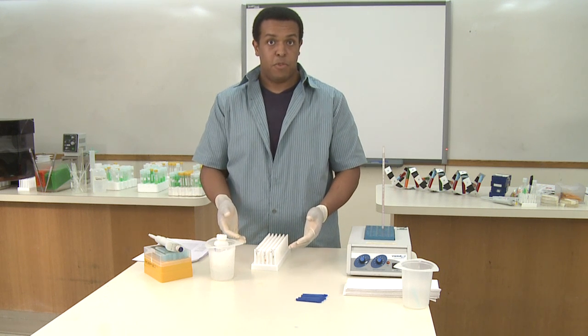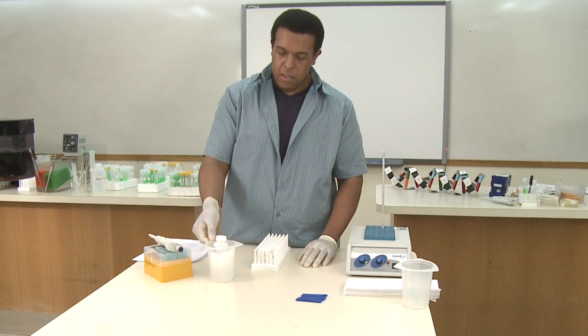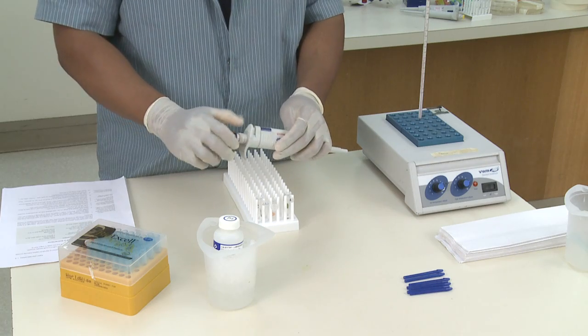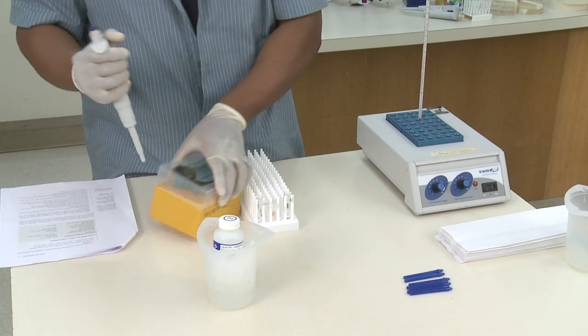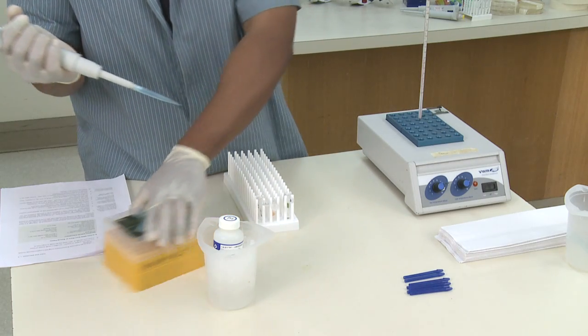Now that you have your samples in their individual labeled tubes, you're ready to begin with the extraction. What we'll need to do is add 100 microliters of the nucleolysis solution, so I'm going to use my blue pipette set to 100 microliters. And always, I want to use a fresh tip to add the solution every time.